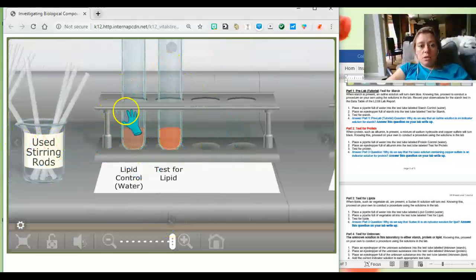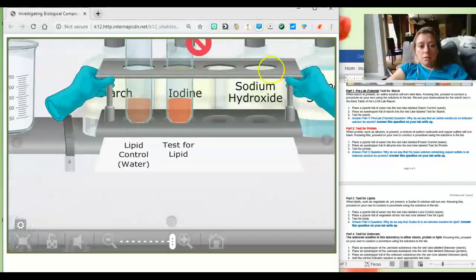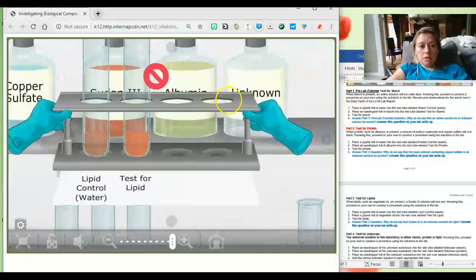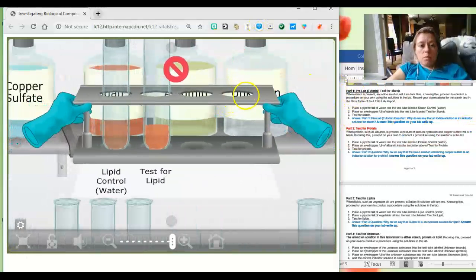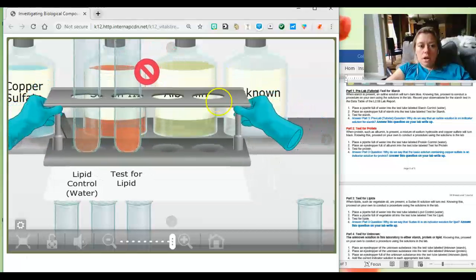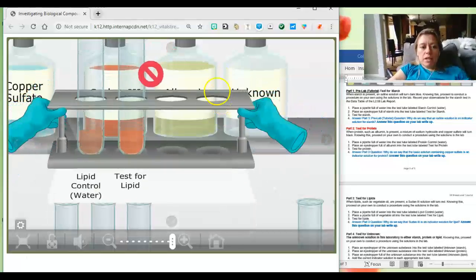And if you look at these 2 and you compare them to the white, and you can compare them to the Sudan itself. Okay, you can tell that the water solution was just the Sudan diluted. This one is different in color. It is hard to tell, but it is more reddish.